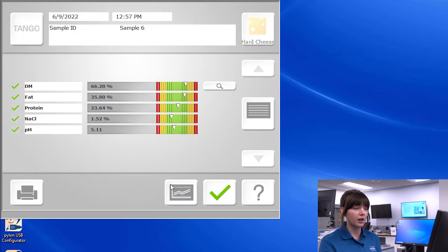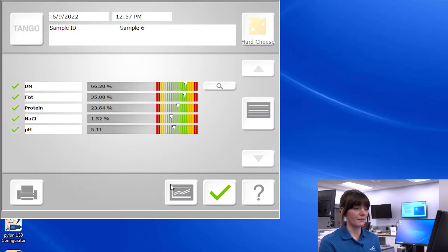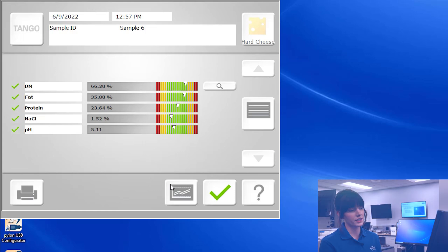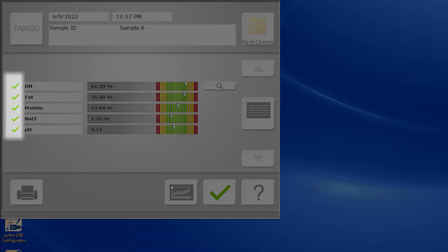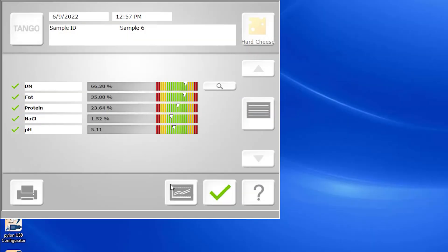These signify to your operators what qualifies as a good sample versus a sample that may need to be sent off for wet chemistry. The green check mark to the left of each constituent indicates that the measurement falls within the concentration range of each analysis, as well as within certain statistical thresholds based on the analyses being performed. As you can see, our Tango can quickly and accurately predict the dry matter and fat content of our cheese, such that when we calculate the fat and dry matter, we're able to verify that it meets the standards of identity for cheddar.